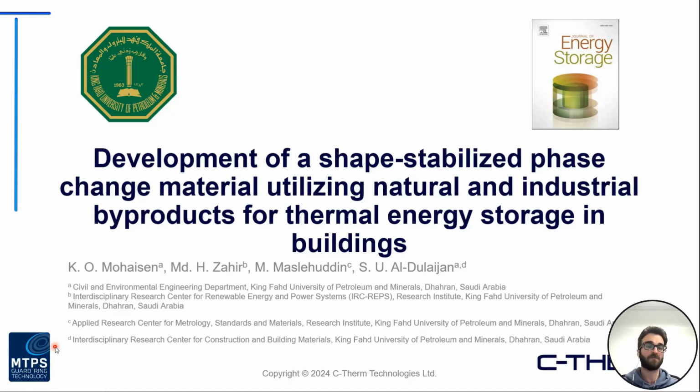So I'll break down some of the components of what they were doing and what they were looking to show, but also focus specifically on the thermal conductivity data that they obtained, and really what story it told about the systems that they were working with.